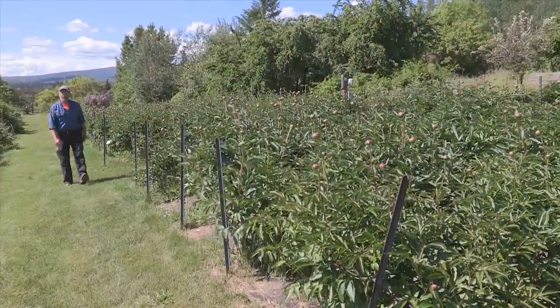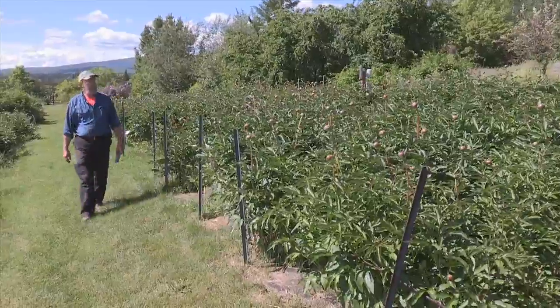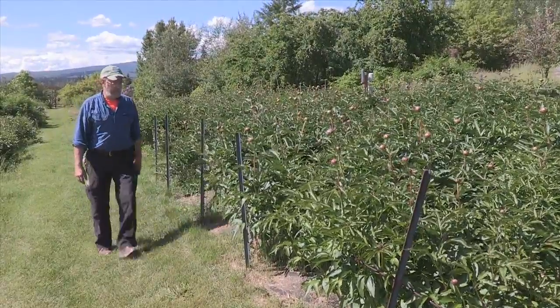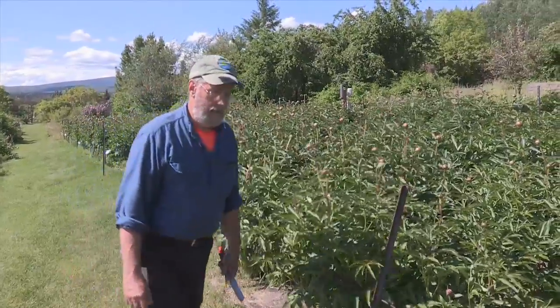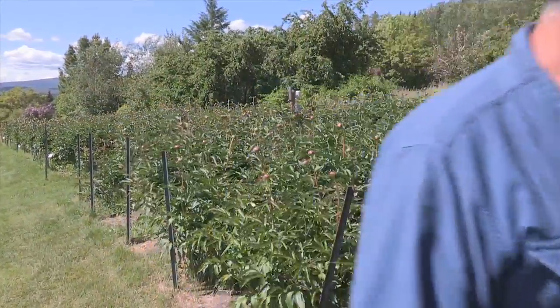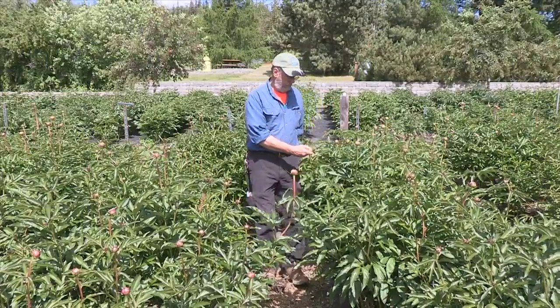In order to establish an acceptable range of plant nutrients, we need to collect tissue samples from plants that look healthy with large green leaves and good growth, and collect leaves from plants that don't look as good, with pale yellow leaves and poor growth, to compare against. Both sets of leaves should be collected from plants that are as close to the same growth stage as possible.